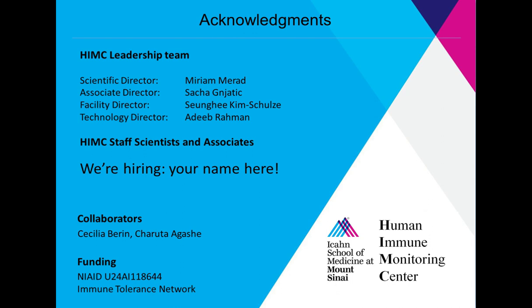Thank you. It looks like we have time for one more question. What is the minimum amount to order an antibody via your custom service? Usually via our custom service, you have to order at least 500 micrograms because this is just the amount where for us it makes sense to produce it for the customer. But for CyTOF, we decided to go with 200 micrograms because we know that the conjugation kits are usually made for 100 micrograms, and 200 micrograms is the minimum we can afford for the customer. So this is kind of a service for the CyTOF users. This is only possible if it's requested for a CyTOF antibody, not for the other antibodies.